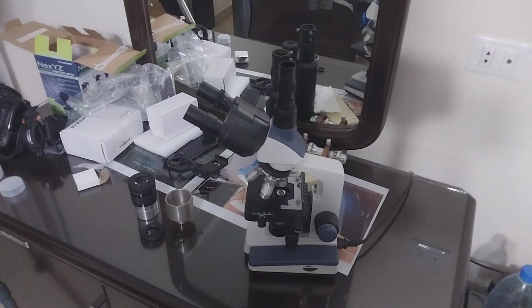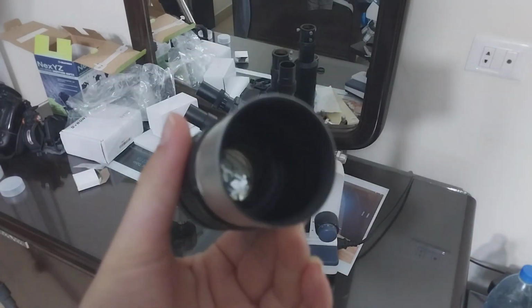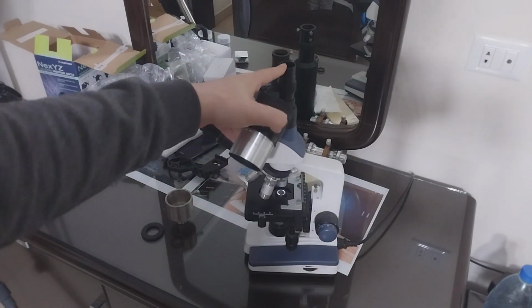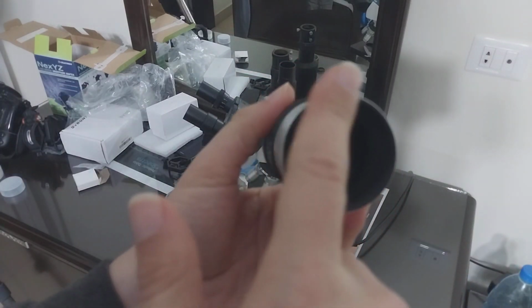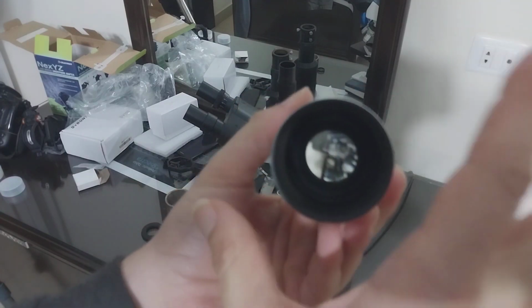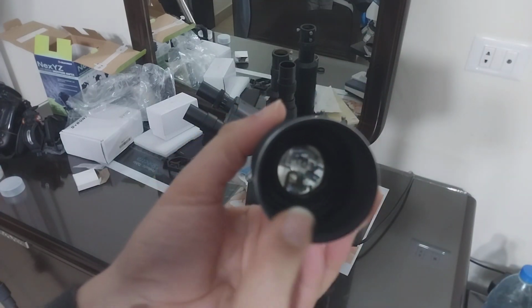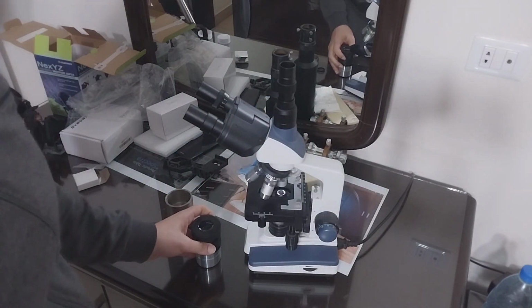Now, in this video, guys, we're going to show you how to install and use this 2-inch telescope eyepiece on this microscope. This microscope has this tiny hole. This is 2-inch here, talking about from the outside. Here it's a little bit less than this. You could say 48 millimeters.